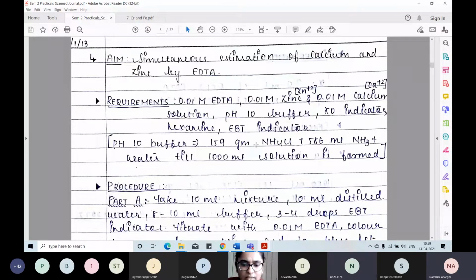क्वेश्चन। Yes, Nick. अकॉर्डिंग टू फर्स्ट में हम जब कैल्शियम और जिंक दोनों बाइंड होते हैं, उसमें से फर्स्ट कौन बाइंड होता है? क्योंकि आपने जैसे बोला कि हमें किसी को पहले साइड में कर दे तो ही जिंक को हम प्रिसिपिटेट कर सकते हैं 10 pH पे, राइट? तो क्या कैल्शियम पहले बाइंड हो जाएगा, रिलीज होगा ईबीटी से, कि जिंक होगा? एक मिनट, मैं नहीं समझी। Could you please repeat it? हम जब इंडिकेटर ऐड करते हैं ईबीटी, अकॉर्डिंग टू यू से कि फर्स्ट हमारा जो ईबीटी होता है वो कैल्शियम और जिंक के साथ कॉम्प्लेक्स बनाता है, हाँ, राइट?